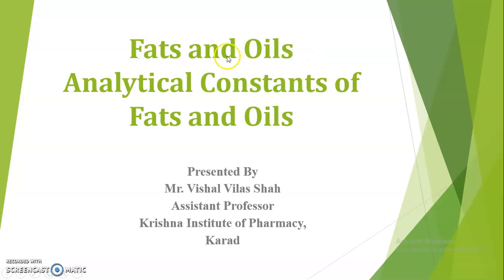As you know, here we are going to discuss the analytical constants of fats and oils. Already in the previous video, I started with one of the analytical constants, that is the iodine value. In the previous video, we discussed one of the methods used for the determination of iodine value, that is the iodine monochloride method.